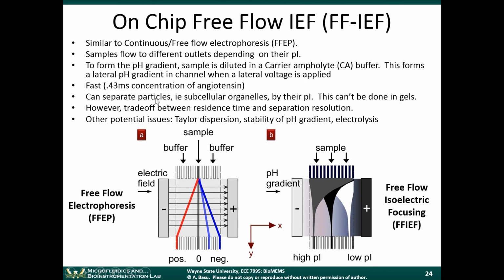Isoelectric points apply to particles as well as molecules. There are some trade-offs with this device, things like Taylor dispersion because you have pressure-driven flow, stability of the pH gradients, and so on. All in all, this is a pretty interesting technique.